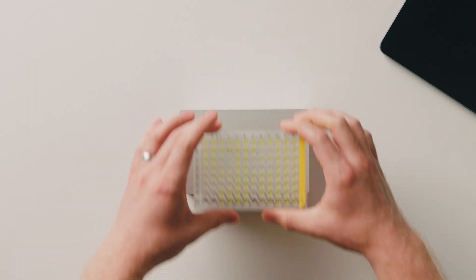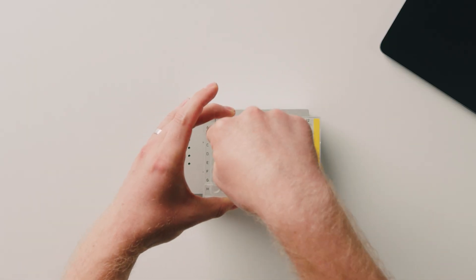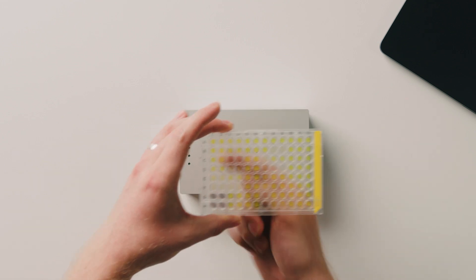This results in a system with a total of 96 detection units, where each detection unit consists of an individual light source and an individual detector. So if we use the 96-well microplate, for each well on the plate we have an individual light source on top and an individual detector on the bottom. This is very different from how traditional microplate readers work, as they almost all work with some form of scanning mechanism.